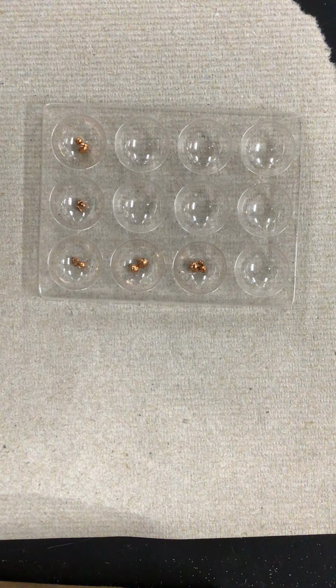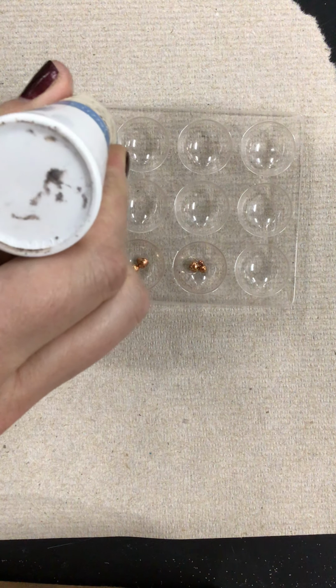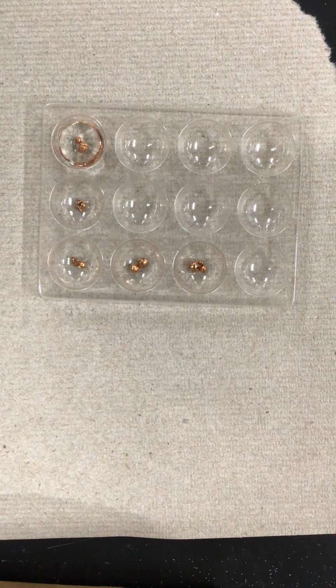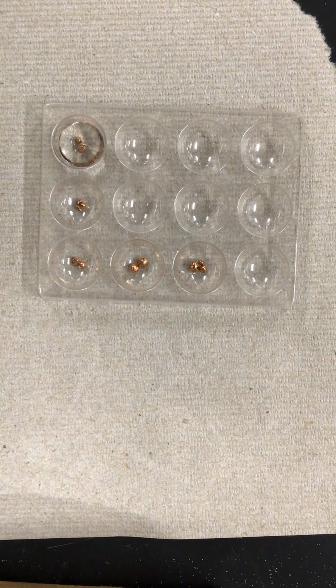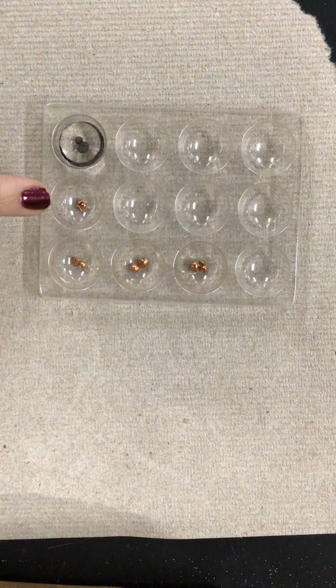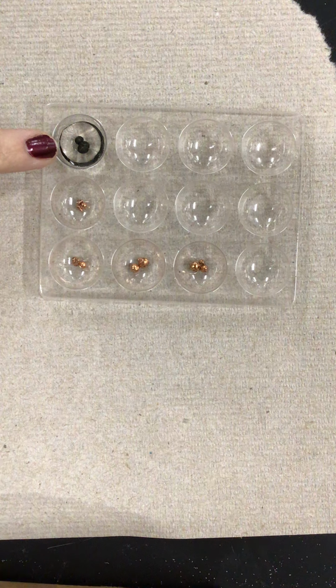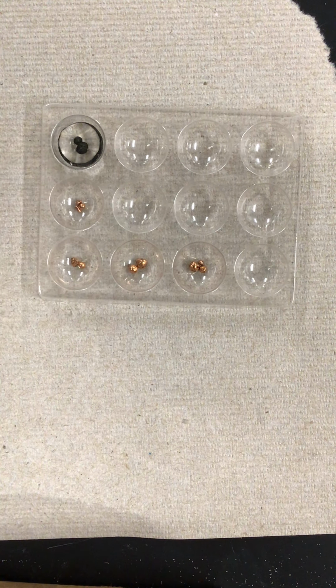All right, so our first solution, again, is silver nitrate. So this is copper and silver nitrate. Doesn't look like much is happening, so we will come back to that. Oh, there is something happening, look. It's turning really dark, isn't it? Look at that. You can see how shiny it was before, and here it looks like it's corroding. It almost looks like it's growing because it's turning very, very black. It looks like something is forming on the outside of that one. So that one definitely had a chemical reaction. Not a violent one, but it was a chemical reaction.